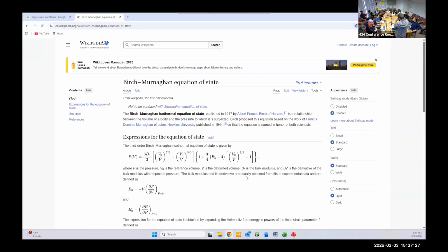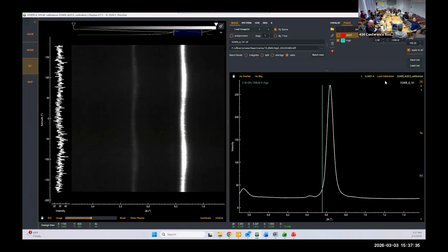Okay. Well, I was just wondering, because you can change the variables to show where your peaks would end up under different situations. I wasn't sure if you use that ability just to see if things would change under different pressures or temperatures, and if what you were actually doing reflected that in your true data results.